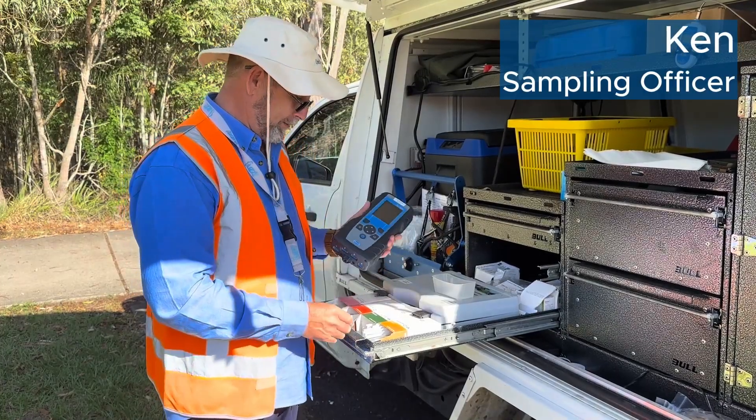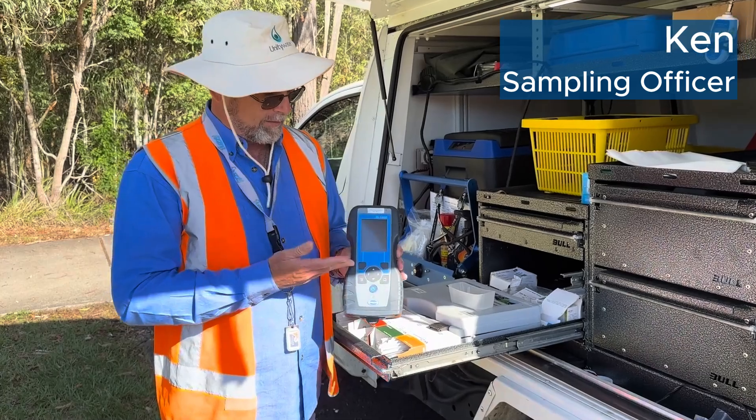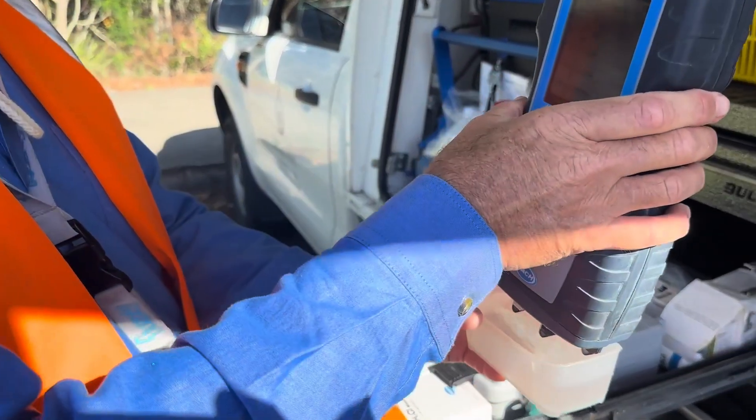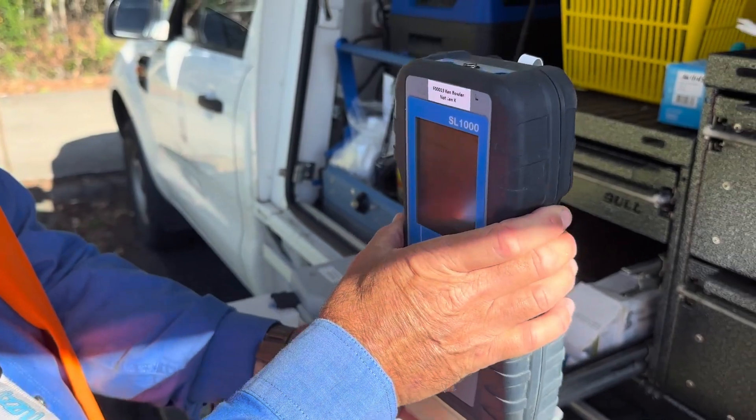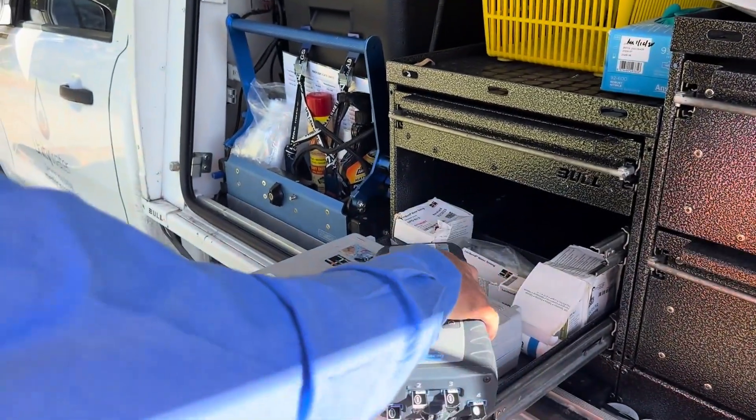So now the next step is to take some field measurements with our SL 1000. And then we just dip, pull, get rid of it and then we let that go.